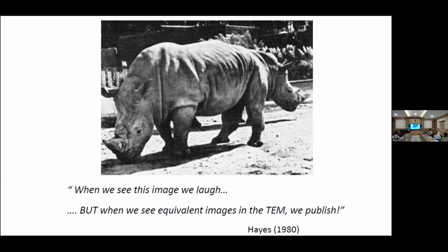You see, if it is a cube, if it's directly projected on the top on the axis, then we will show a square shadow there. Then what will happen if we tilt it? Maybe we'll see some pentagon or something like that. So we should be very careful about inputting TEM images.